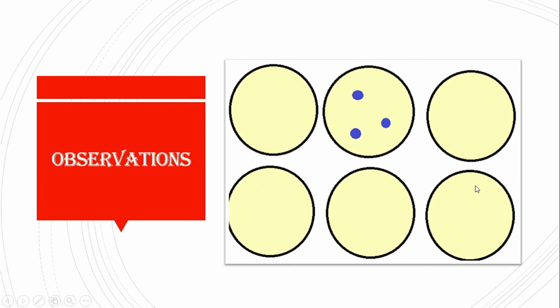Now, observation can be done using a stereo microscope, as I said, or a plate reader, wherein the presence of these spots indicates our cytokine producing cells, or protein secreting cells, were present, and also we can say that the number of spots is proportional to the number of cells. So if my cell was here, they have produced cytokines, and the substrate is converted into a colorful product, and we observe a spot. So the bottom line is the number of spots corresponds to the number of cells in the sample.